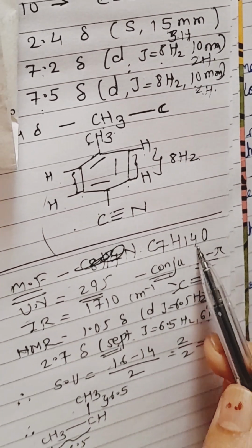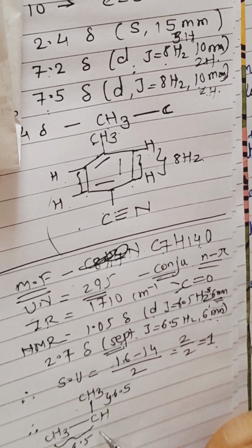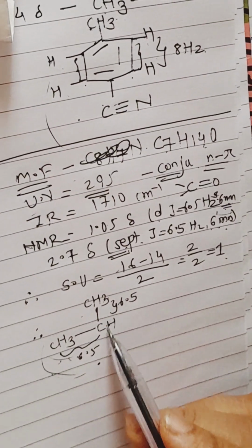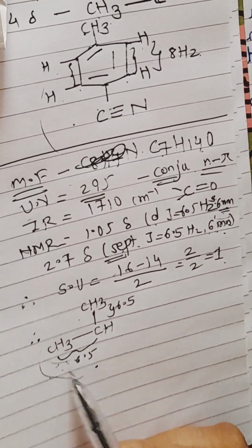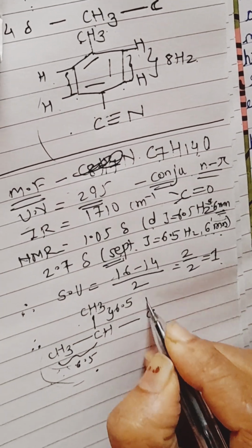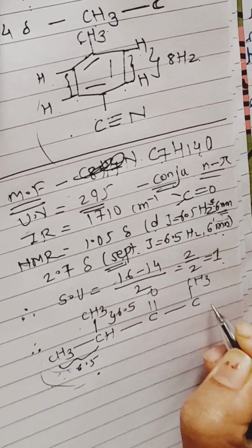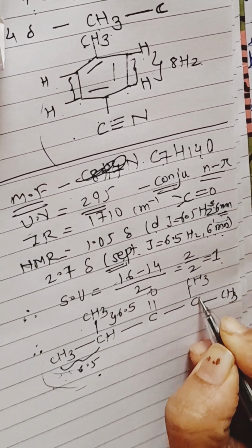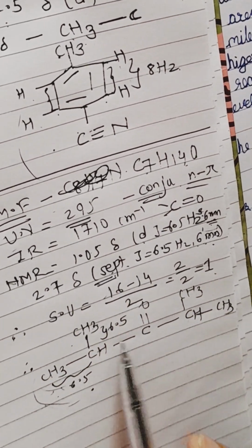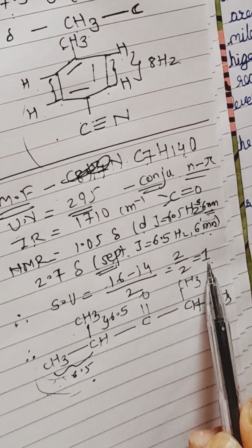Only this much of the fragment we get from the data. Now look, how many carbon atoms are there? 7 carbon atoms, and here we got information regarding only 3 carbon atoms. So friends, it may be a symmetrical molecule. Now fulfill the data: the carbonyl group accounts for the 1 site of unsaturation.